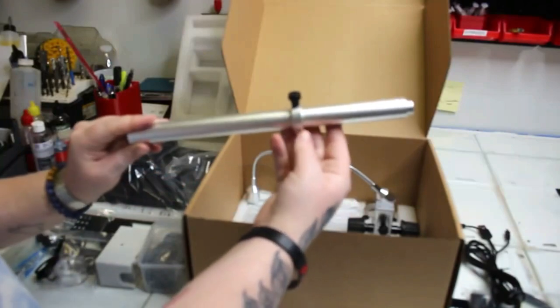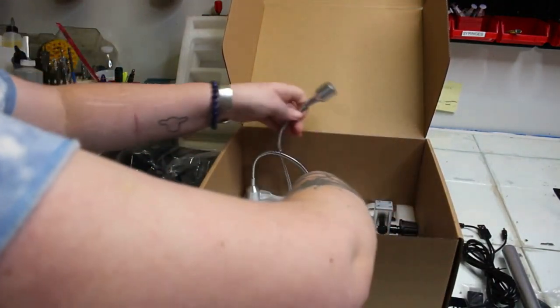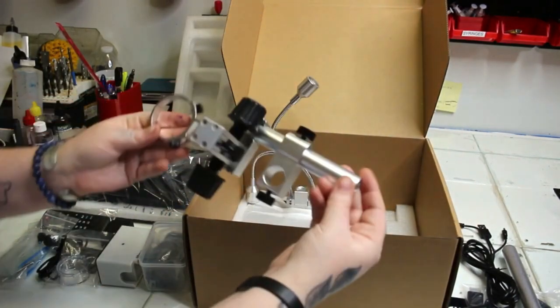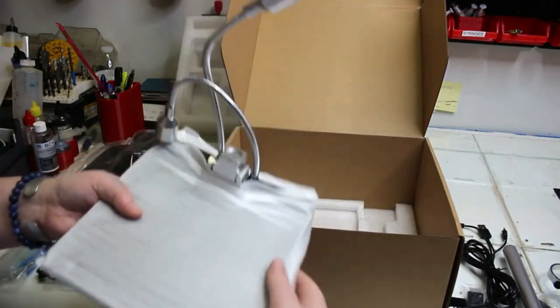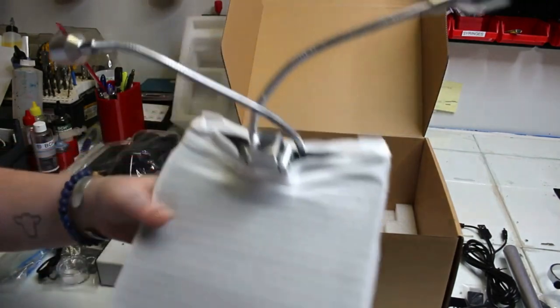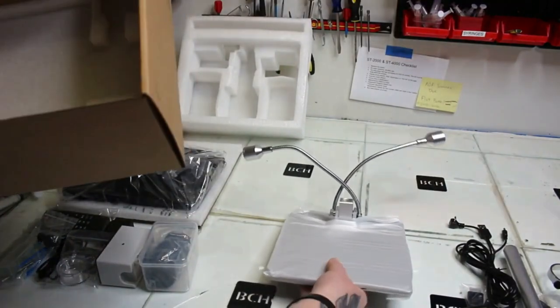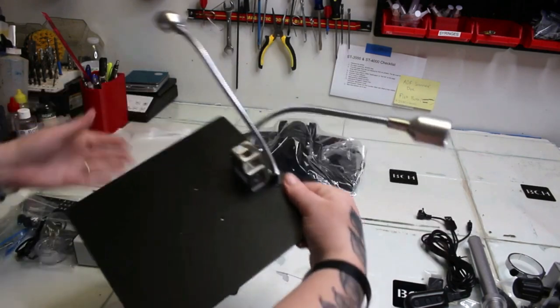We have this long metal rod with a loose lock ring on it. We'll take that out, and then we'll take out this part which we're going to call the boom arm — that's what's going to hold your microscope over the base. Here is the base with the two gooseneck lights, and you can see it has the base wrapped in soft styrofoam so it doesn't get scratched. We'll slide off that soft styrofoam.